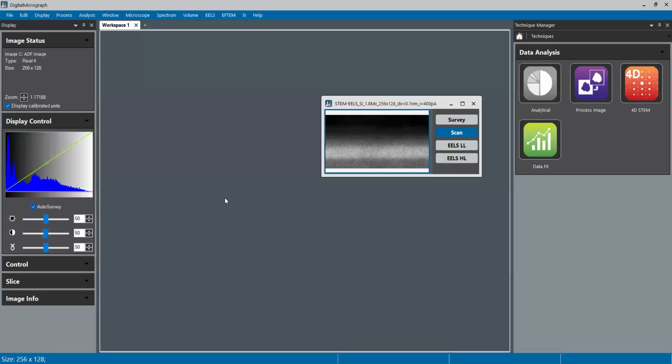All right, good evening. So I'm getting really frustrated here because DigitalMicrograph won't stay open. Then I'm having to boot it up again, and the share is getting canned when DigitalMicrograph crashes, and then I'm forgetting to tell it to share again, and then I'm trying to figure out how many minutes I went in, because before I didn't record what I was doing. So this is really, really frustrating me.